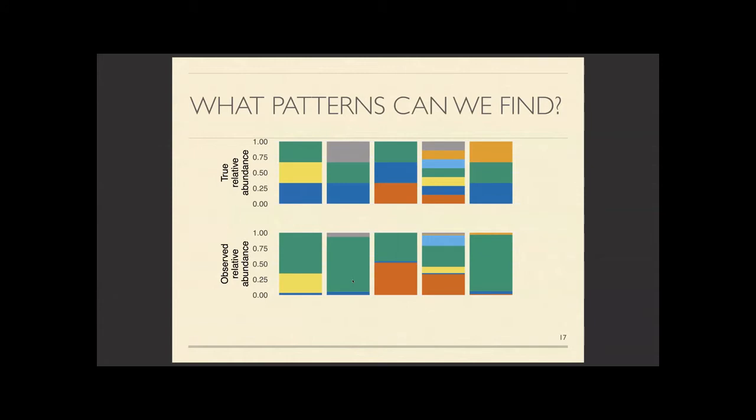Okay, so I've pulled out 5 samples, some of which were shown on the previous slide, and I've shown the true relative abundance, not copy number adjusted, and the observed relative abundance profiles that we have. And what we see, if we look closely, is that this green taxon, which I believe is Lactobacillus iners, tends to be over-observed compared to this blue taxon. You'll notice that all the green and blue taxa are present in every single one of these samples.